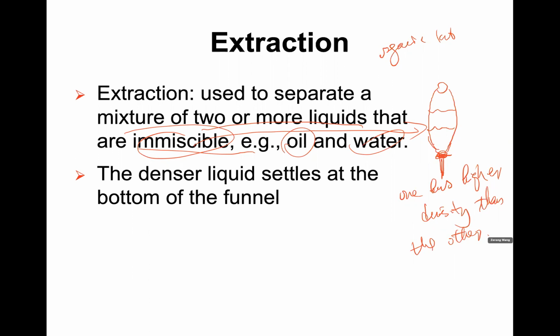In this case, you have two solvents. For example, we have methylene chloride versus the water. And this water, we know that the density is about 1 gram per milliliter. And the methylene chloride is 1.4 grams per milliliter. So you will see when you have those two, this is the organic. So this will stay at the bottom and this will stay on top. Now, this is the one way.